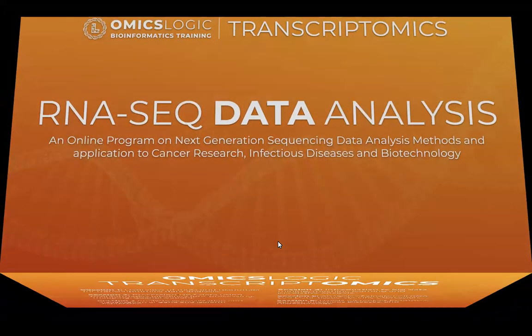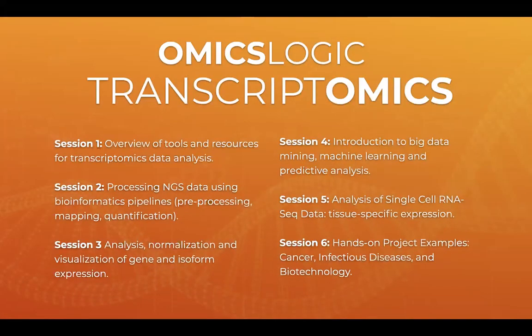Before we do that, let's take a look at some of the different methods that we covered and where we are right now in the full program. We start off the program with reviewing the basic processing pipelines. Remember that when you process the data, you want to make sure that your reads are clean from any artificial sequences. And then the important part of that processing is mapping to understand the level of expression of different elements that compose together a gene.